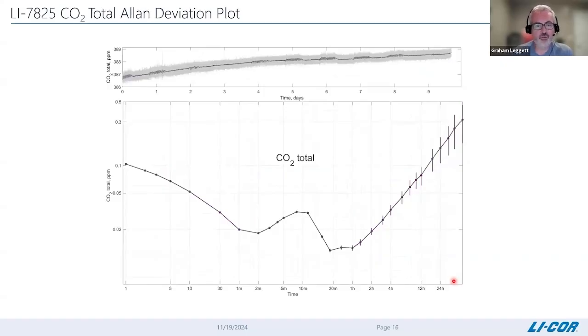Because we're measuring all 4 of those major isotopologues, it is also reporting a very highly precise and potentially accurate CO₂ concentration. So our LI-7815 instrument, which is our current high precision CO₂ concentration instrument, simply measures the C12 line and then reports total CO₂ based on natural abundance of those other major isotopologues.